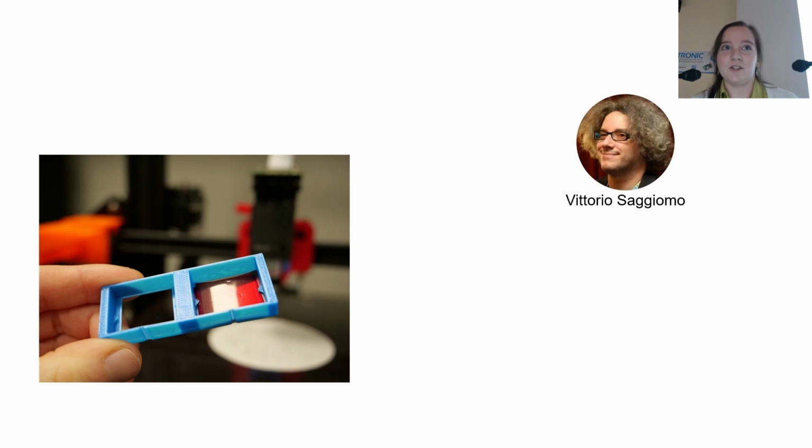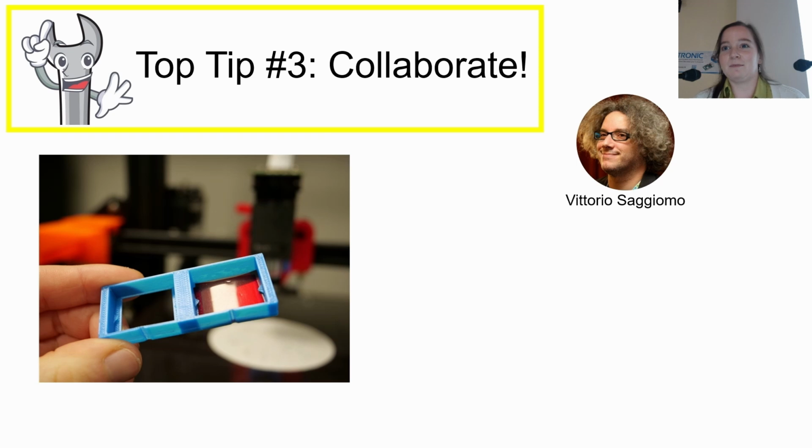This wasn't me that designed this. This was designed by Vittorio Saggiomo, who's a researcher in the Netherlands. And Vittorio has a fantastic eye for looking at something and making it simple. He just knows how to design things so that they can be 3D printed easily without supports or any complications like that. So that's my third tip, is to collaborate with people.